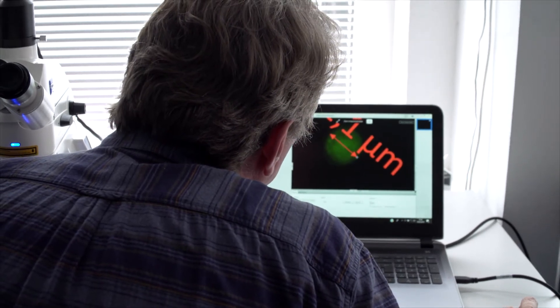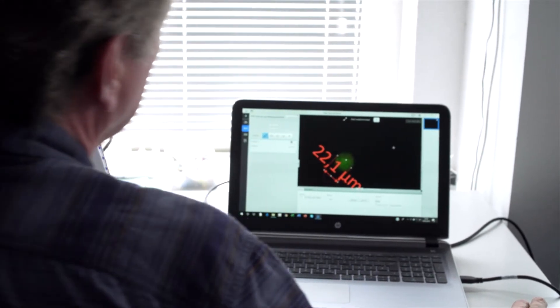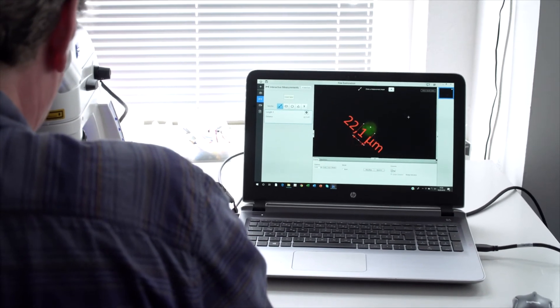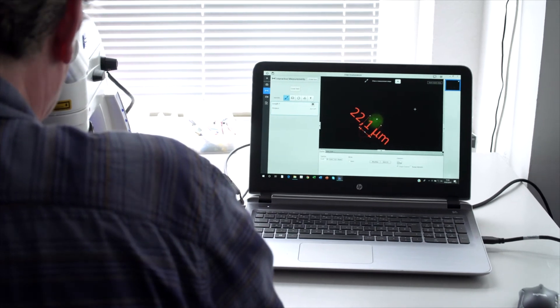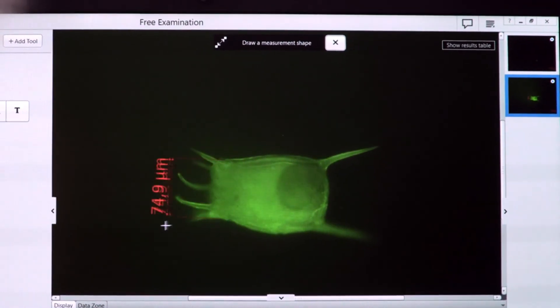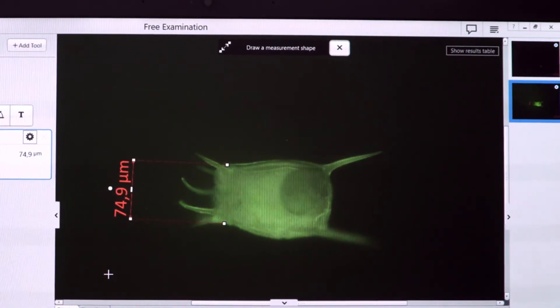I take a photo and then change to the size measurement. This is 22.1 microns in minimum dimension — so we have one survivor on the discharge. Here is another one, but there is also phytoplankton in this shape. This one is 74.9 microns — that is then too big.